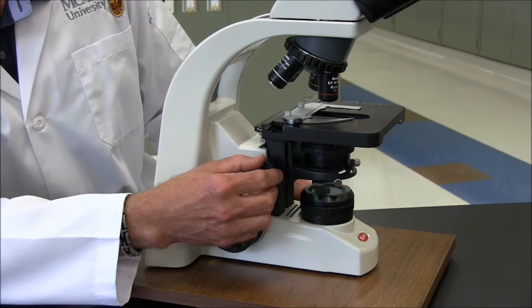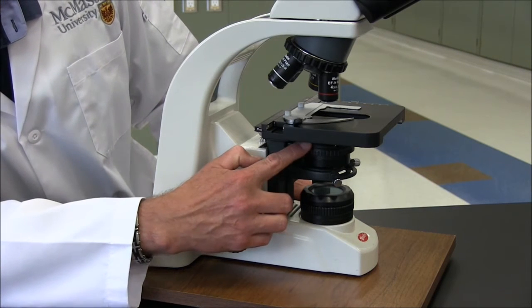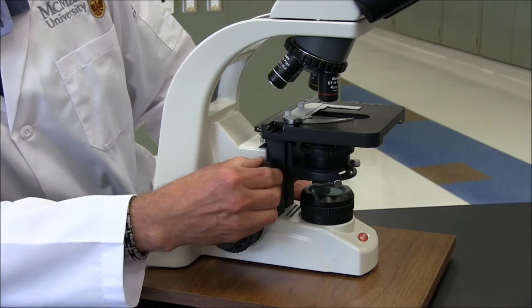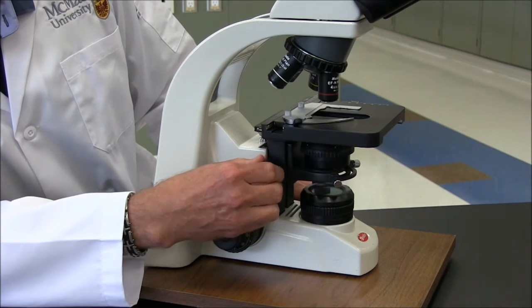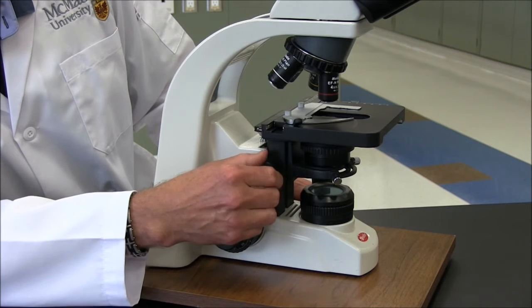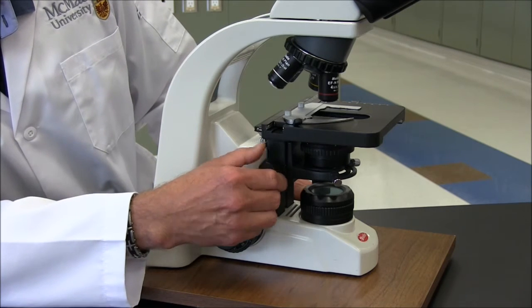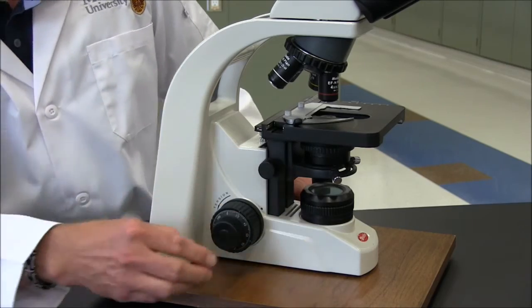The other knob here is the condenser focus knob. The condenser is located underneath the stage, and this knob moves it up and down. This is part of the Kohler illumination process, which we're not going to be discussing in this video. So normally this will be set for you, and you don't have to touch it.